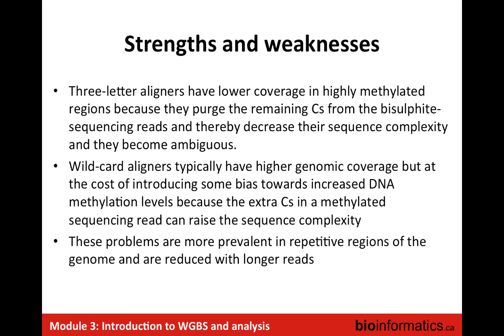But if you look in repetitive regions, that's a bit more of a challenge. And in some applications, those are the regions that are of interest, because looking at repression of these regions is what you're looking at. So again, it's not trivial, but there's really no perfect way of solving this except with longer reads potentially.